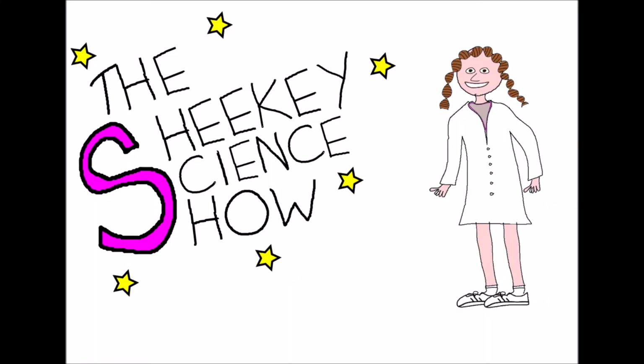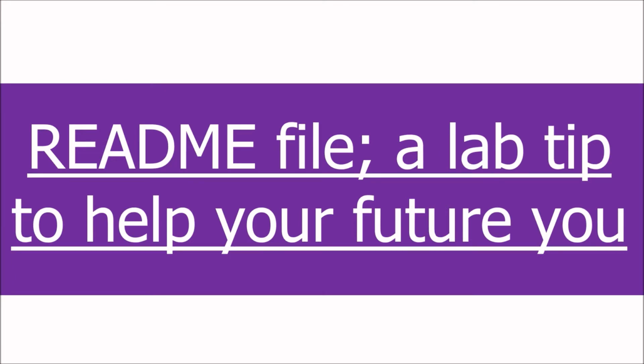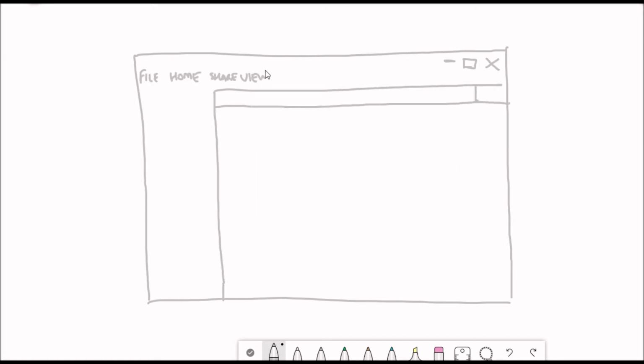In this video, I'll tell you about README files, a lab tip to help your future you. So, have you ever looked back at some of your results and wondered, how did I analyse this data? Where did these results come from? Or looked at a figure and gone, how did I generate this? What did I click on to get to this position? Or looked at your Western blot scan and wondered, what exposure did I use for this?